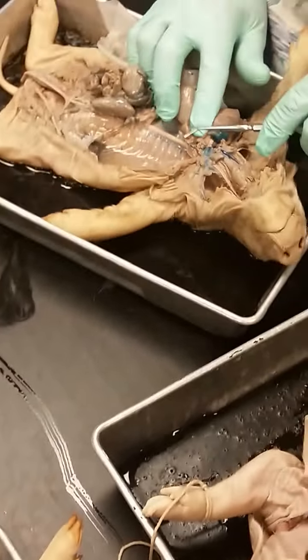And then right here, you see where that ridge is coming out towards the duodenum, right here? That would be the common bile duct right there. So you can see cystic and you can see the common bile duct. In fact, there it is right there. Everybody got it?